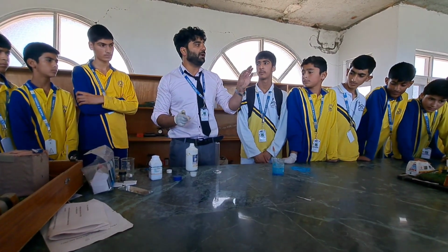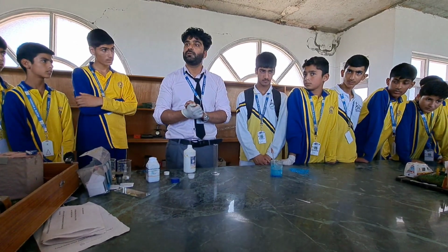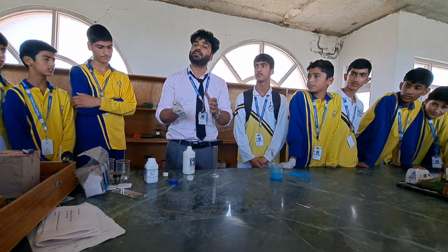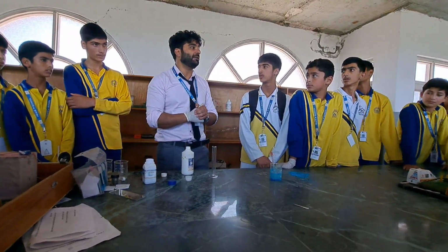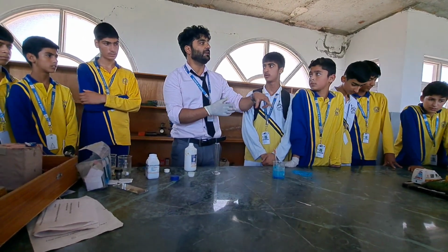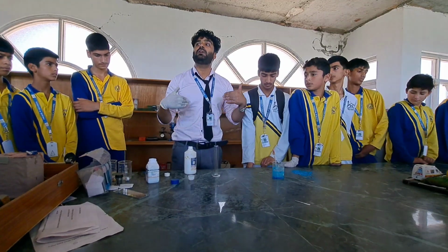Okay. Can you name any other characteristic which is found in this reaction? Evolution of gas and evolution of heat. And there is another characteristic in this particular reaction, and that is the change in temperature. The temperature of the reaction mixture at the end will rise up.